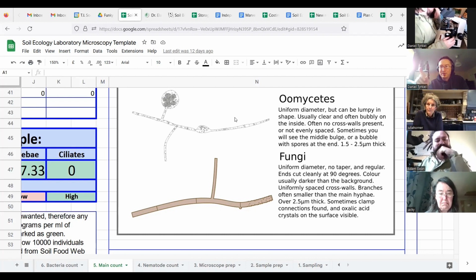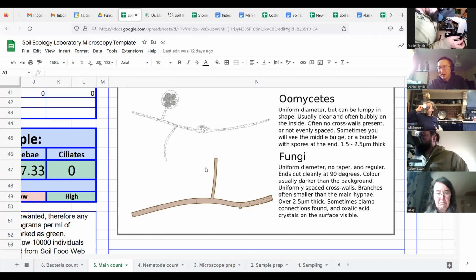So if you have a well-developed compost which has been aerobic, which has had lots of woody elements in it, then you should be able, after several months, to start seeing these guys. And that's what you're looking for. And if you're still seeing these guys in that several-month-old compost, that means that there are some nutrients floating about that are not being taken into bodies of microbes, and opportunistic organisms still have a chance to develop, and they can also then attack your plants. So that's why we're looking at this to gauge how well the compost has been developing, and we're looking for these guys to be present in our solution.